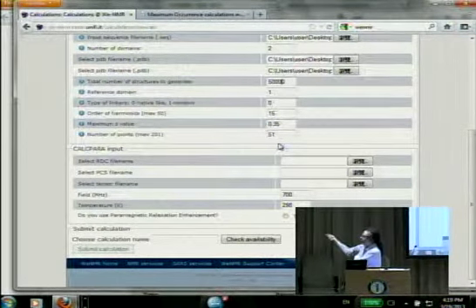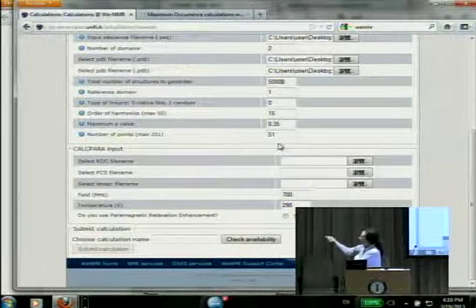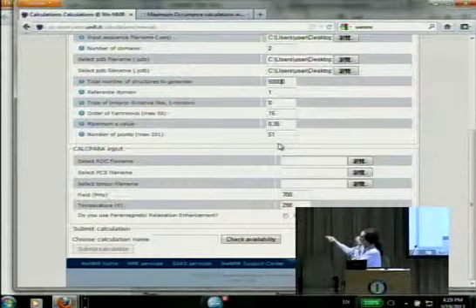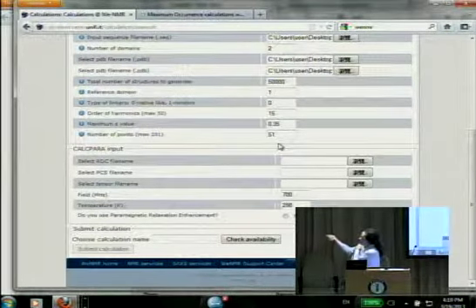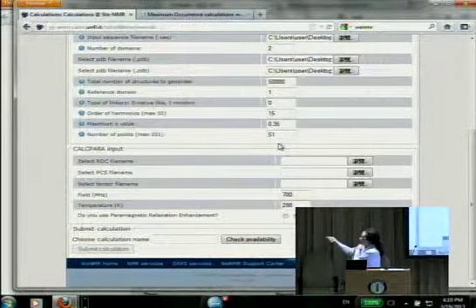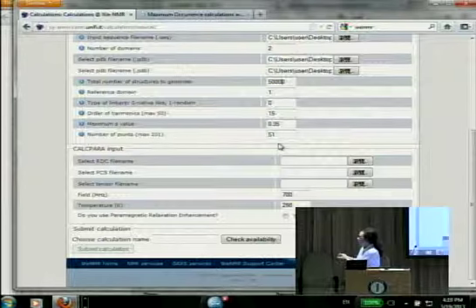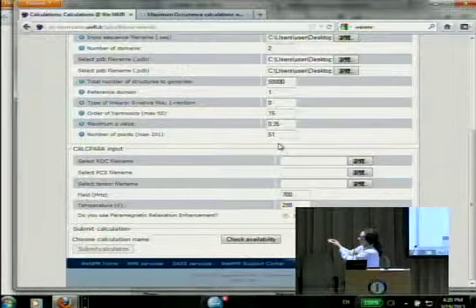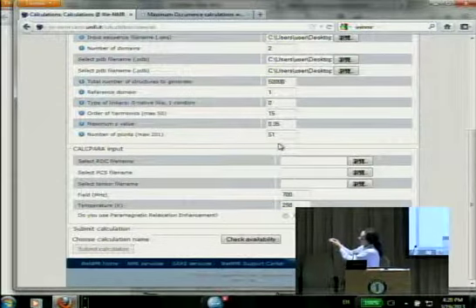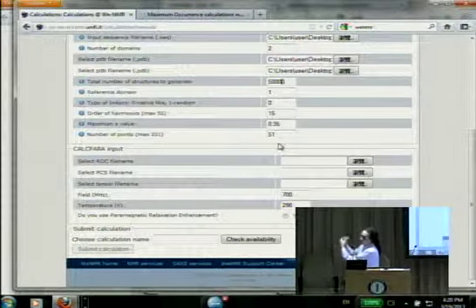These are parameters that determine how large the space sampled is, and typically these are okay. You may want to change this type to native-like or random. It defines what kind of distribution of the configurations of the residues in the linker you want to span. So if it's completely random, basically the phi and psi angles of the residues in the linker are randomized completely, or they follow a kind of Ramachandran distribution. This is built into the SACS program.